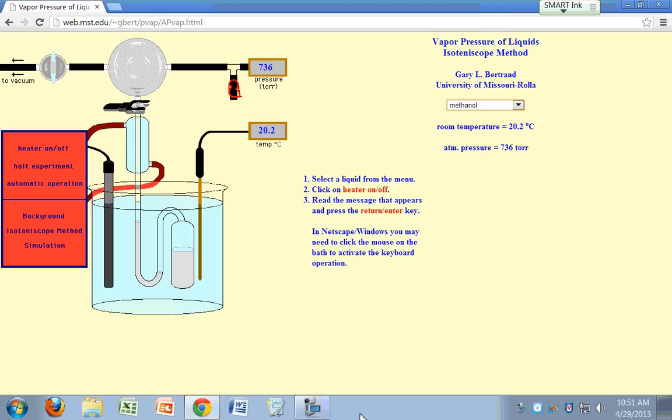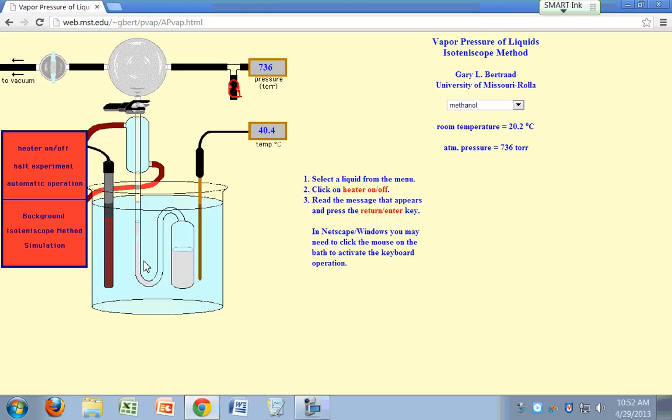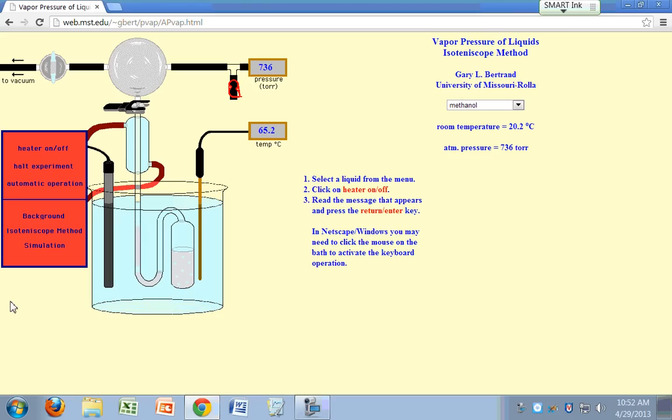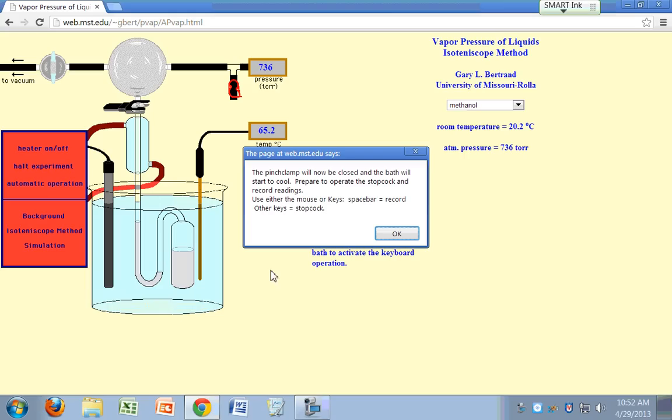What's the first thing you need to do? You need to pump out all the air from your liquid. So you heat it up, turn the heater on, and turn on the vacuum. Heater is on, and so your gas, your air is bubbling out, and some of your gas is being pumped.